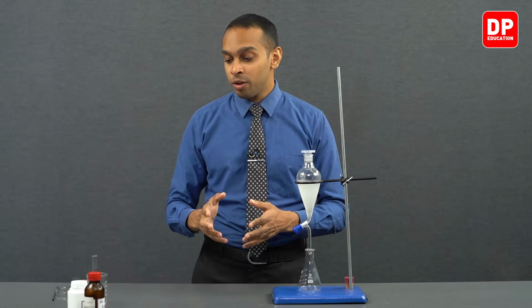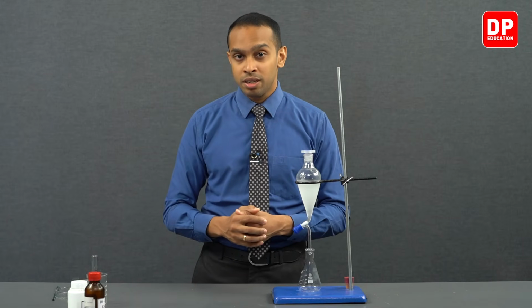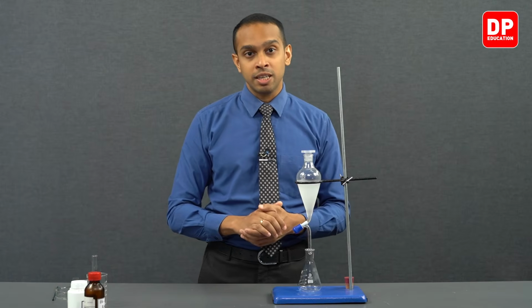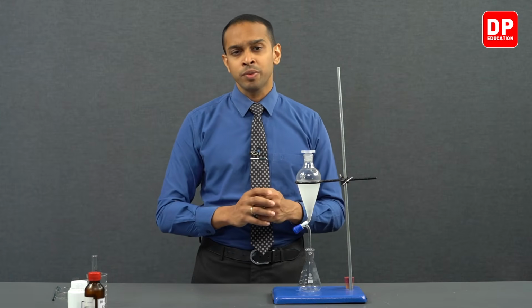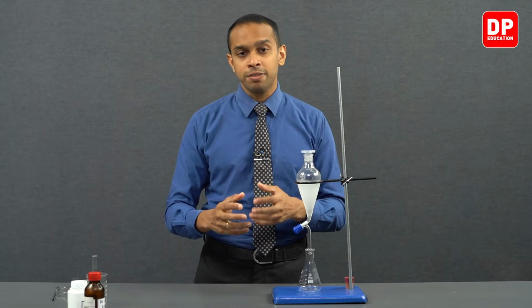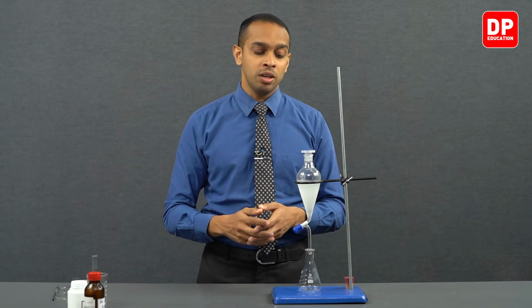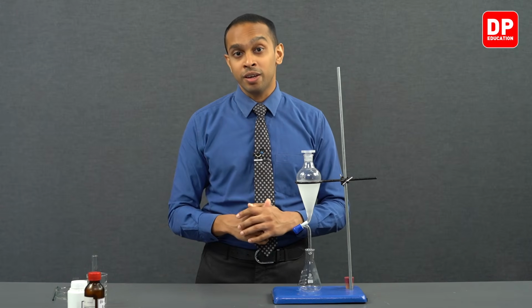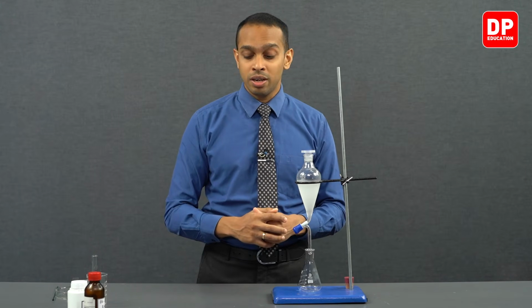So now we are going to move on to the step where we will measure 10 cubic centimeters of diethyl ether and transfer it into this separating funnel, and then we will mix the solution really well. After mixing, we are going to separate the diethyl ether layer from this aqueous mixture.